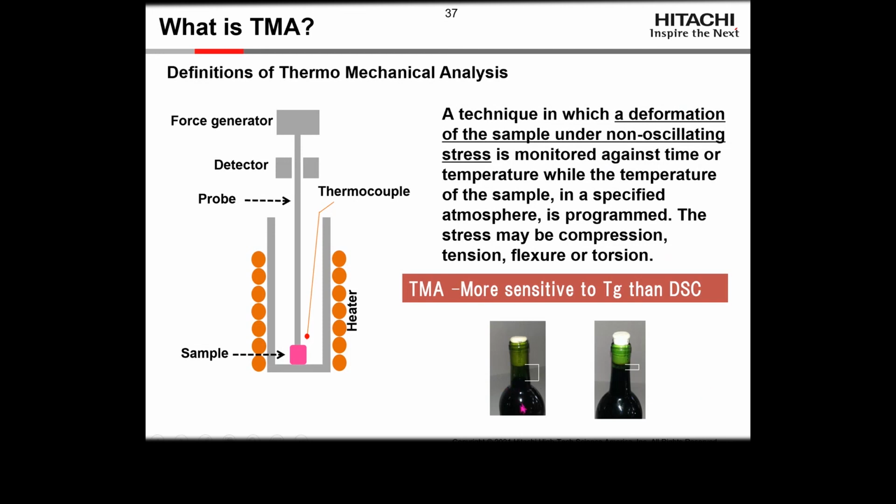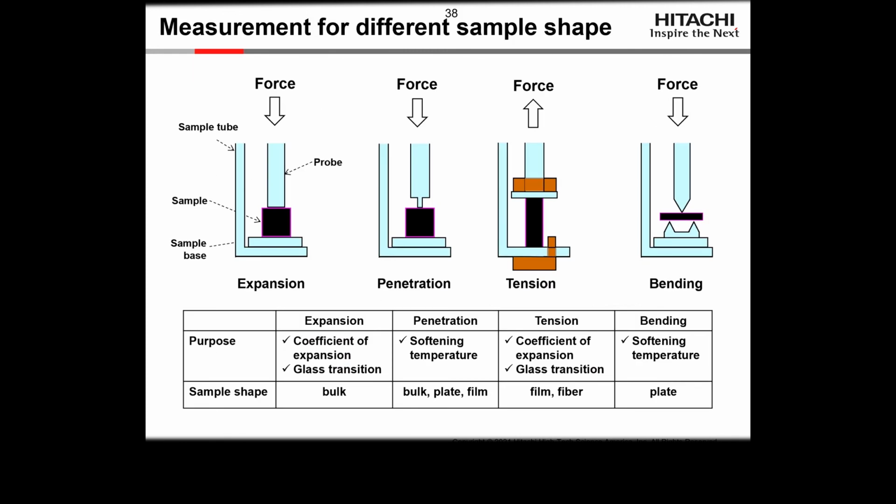And an example of thermal expansion is, here's a bottle of wine that was made and bottled at about 20 degrees C. And here's the same bottle after sitting out in somebody's backyard at 40 degrees C in the Texas summer. And you can see how the expansion of the liquid has compressed the air in it, and it's actually starting to push the cap out. So, a very visual effect of what thermal expansion means and what the problem is.